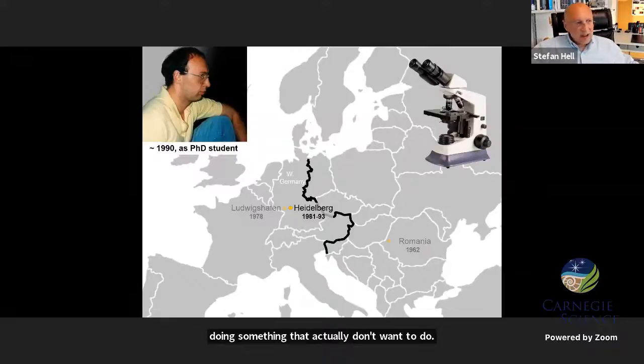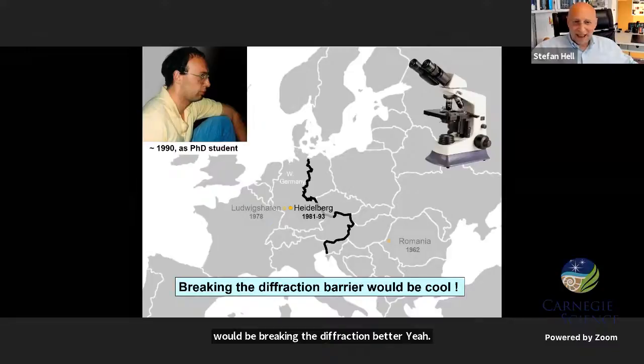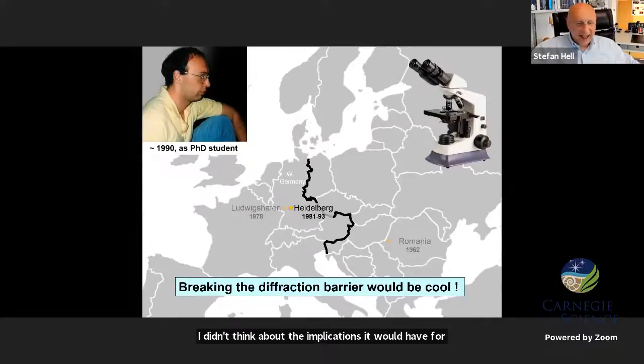And so out of this frustration, I thought maybe there's still an interesting problem left that could be worthwhile pursuing in this boring subject of light microscopy, a 19th century physics subject. And I thought, okay, the only thing worthwhile pursuing would be breaking the diffraction barrier, because that's something no one believes is possible, and that would be kind of cool and basic and interesting. I didn't think about the implications it would have for the life sciences, to do something good for mankind or whatever. I found it cool. This was the only cool problem left in this boring subject of light microscopy. And this is how I got actually into the field.